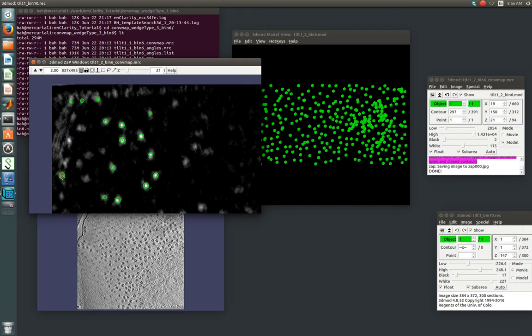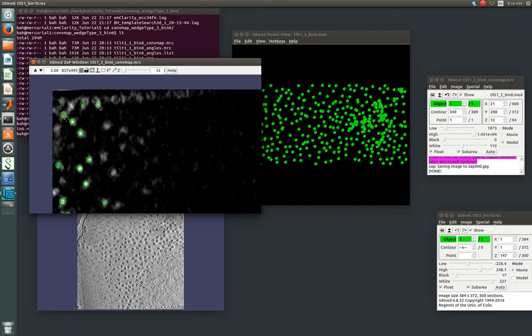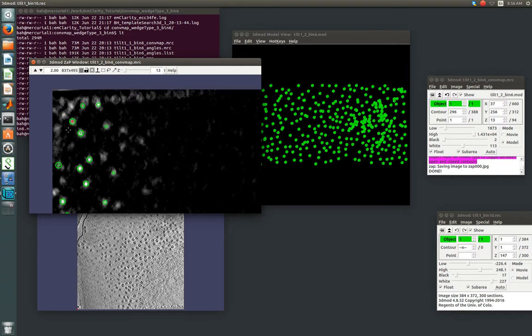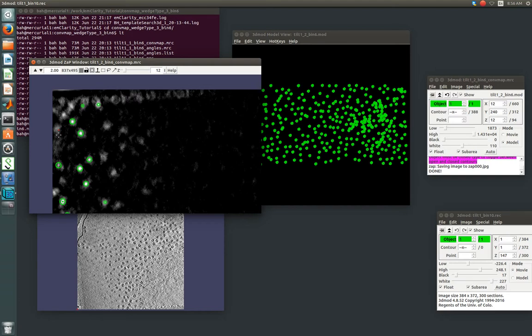Now, doing this in the convolution map is a bit slower. And what it's particularly good for is when you have finer grain decisions to make. Like, is this a true hit or is it not? And we see if we zoom in on it a little bit that that looks like it really is a true cross-correlation peak.